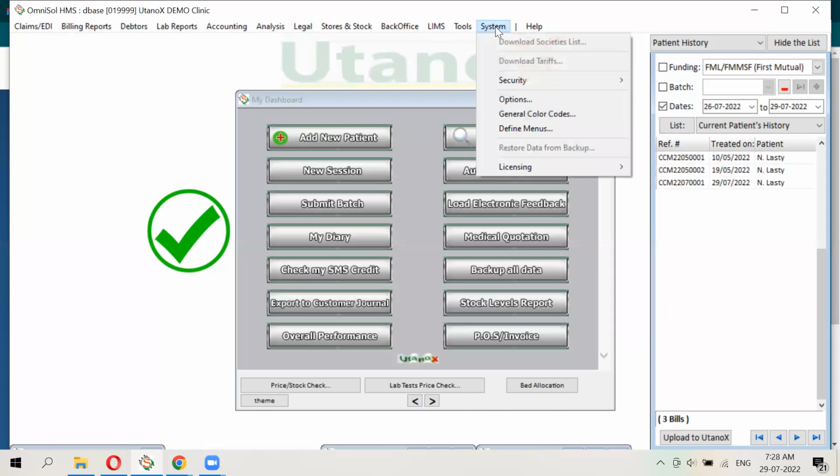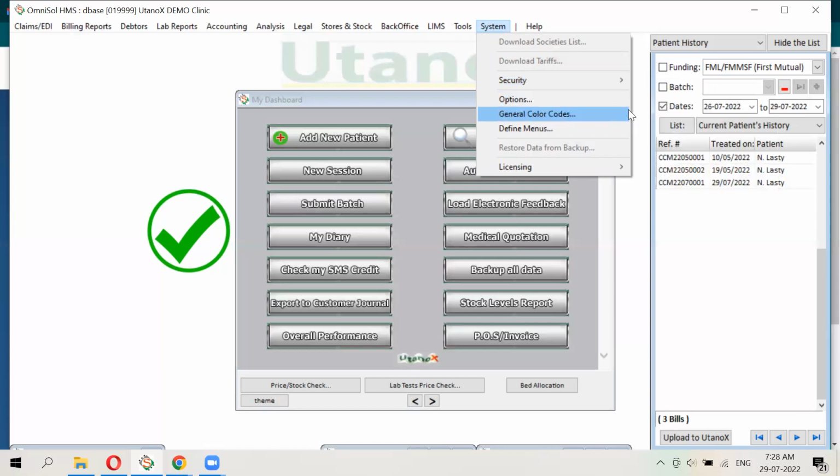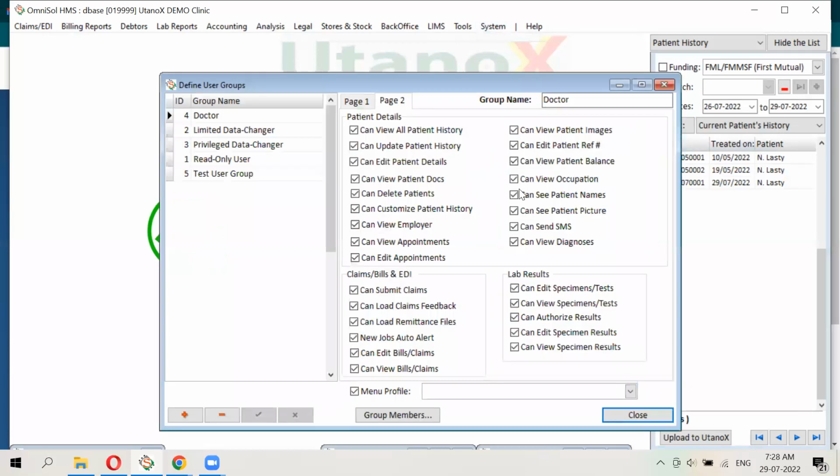Right. So that's under the category of user permissions. That's basically having a user who has got restricted permissions, which we already take care of very well, with user groups and permissions. So the different user groups. That one would be a limited kind of user who can only do specific functions.